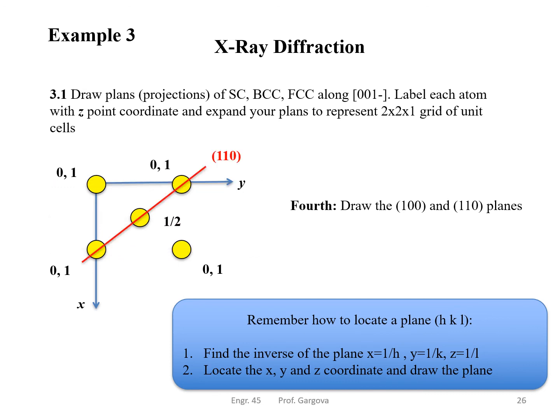However, when we do the family of the 1, 1, 0 planes, we see that the distance is bigger than 1/2 and can potentially be an integer of 1 and can lead to diffraction patterns. So it satisfies the rule that the sum of H, K, and L has to equal an even number. And therefore we see a diffraction pattern for these d-spacings of the 1, 1, 0 planes.